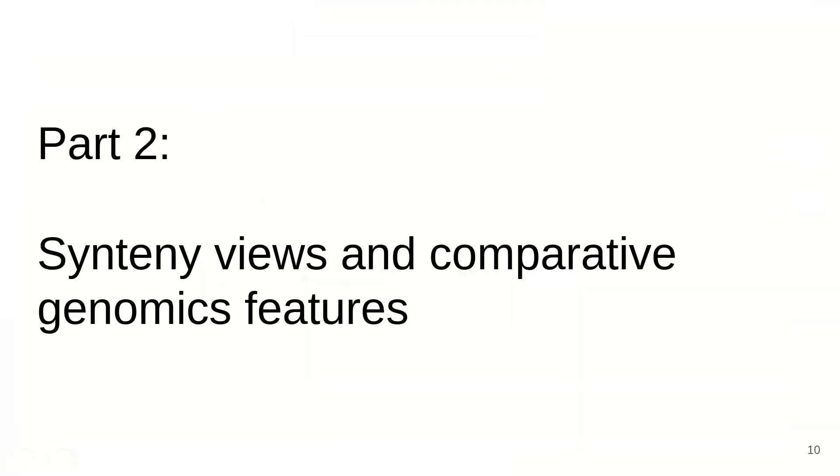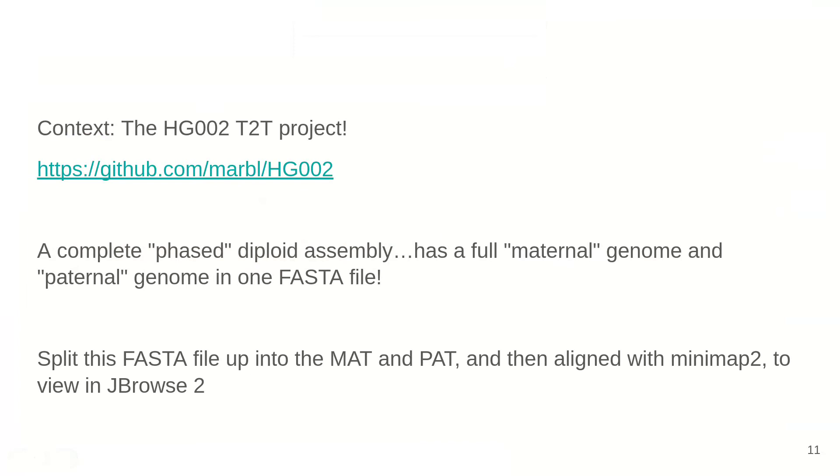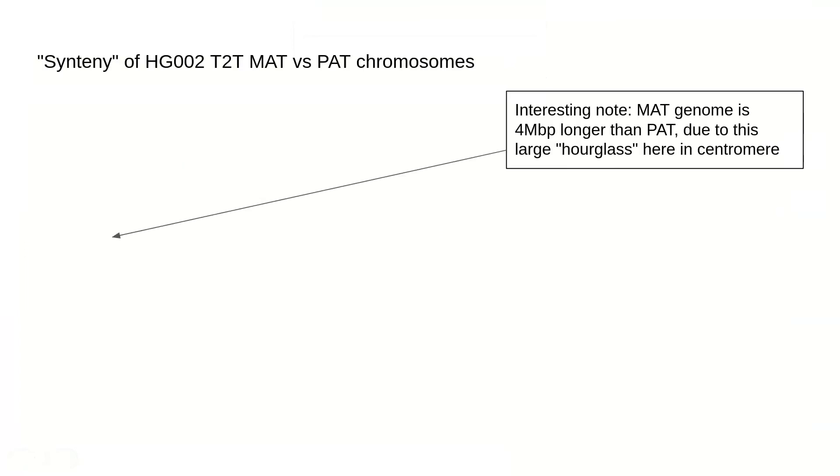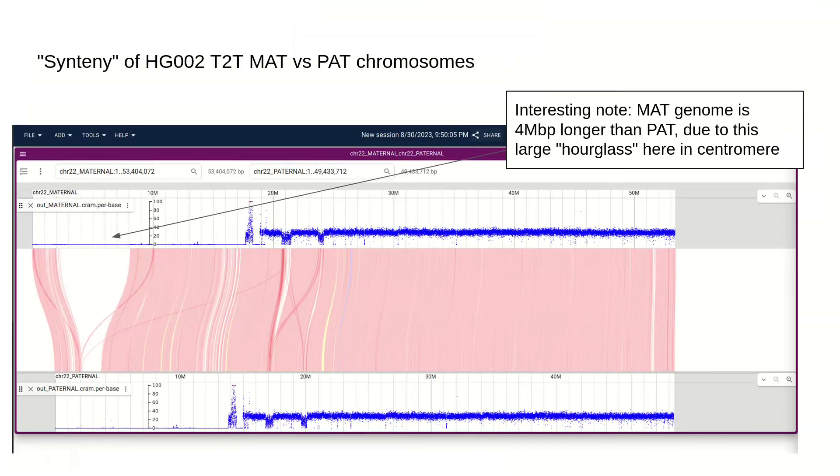Now we're going to look at some of the synteny features, and I'm going to tailor this to our SV hackathon and some experiments I did. The context is the HG002 T2T project, which is interesting because it's a complete phased diploid assembly with a full copy of the maternal genome and the paternal genome in a single FASTA file. What I did was split the FASTA file up into its maternal and paternal components and then align them together with Minimap2 to view in JBrowse. With this loaded, we can look at the synteny of the maternal versus the paternal genome. We're focusing on chromosome 22. One thing that's interesting is the maternal chromosome 22 is a full 4 megabase pairs larger than the paternal copy, probably largely due to this hourglass-shaped locus in the centromere. The blue is showing the coverage of the same read dataset that was aligned to both copies.